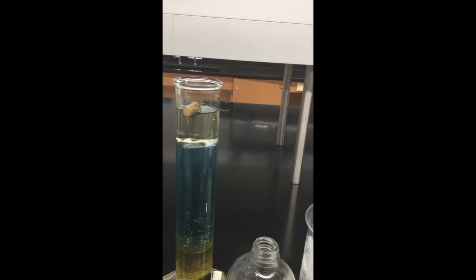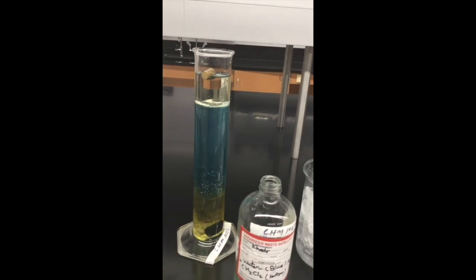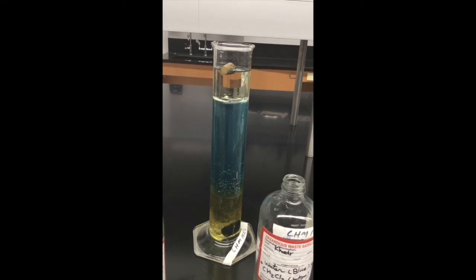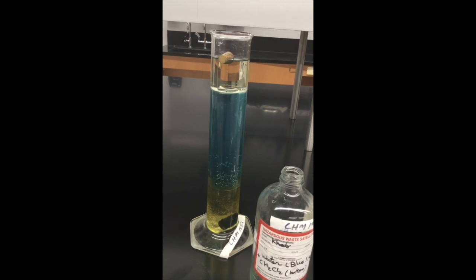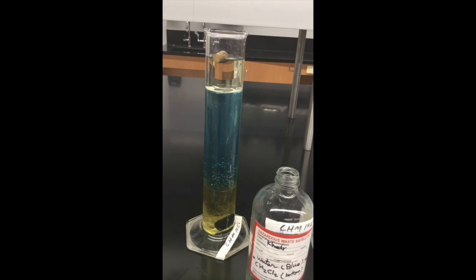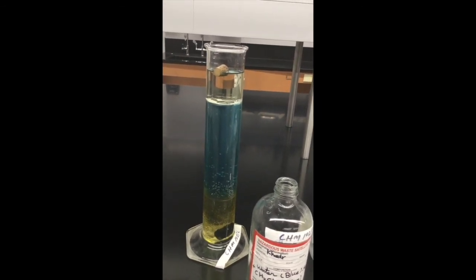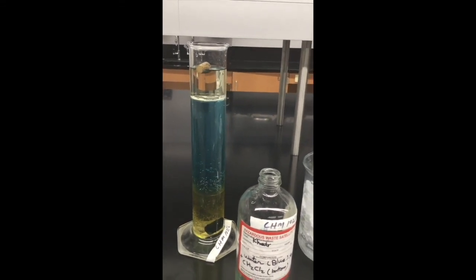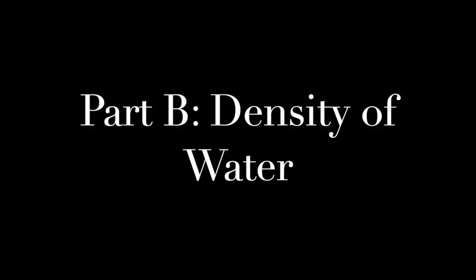I just added the ice cube, and your job is to label where the four substances are: rubber stopper, the glass, and ice, and the wooden cork. Please indicate in your data sheet before we move on to part B.